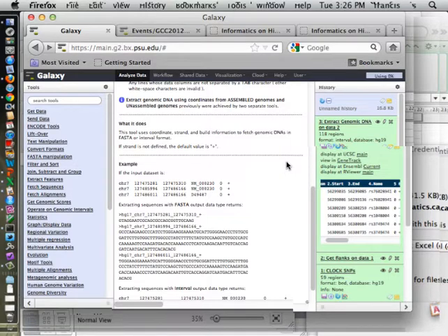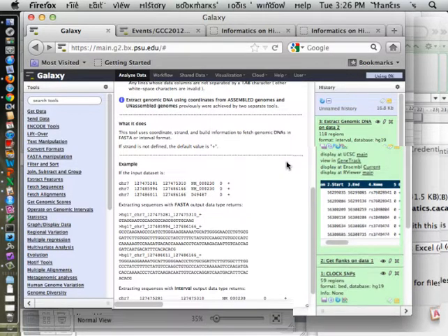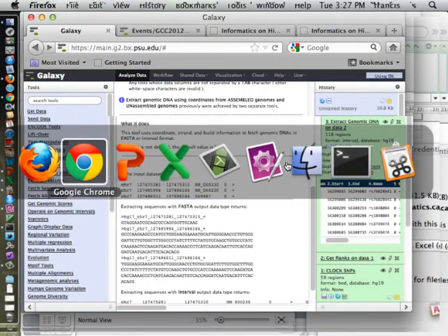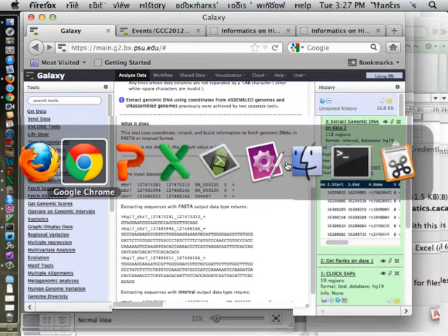Pairing up is not happy either. Well, the thing is, you're going to bug. So this is an example of unkind use of shared resources, which were not really meant for next-gen sequence analysis. Although, that said, the files we're working with are relatively small. So those of you who do not have the cloud version working should try the browser version.